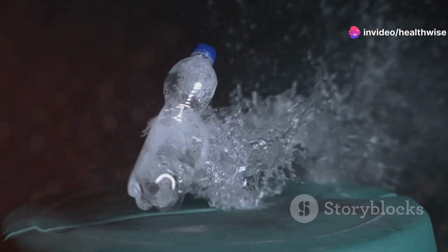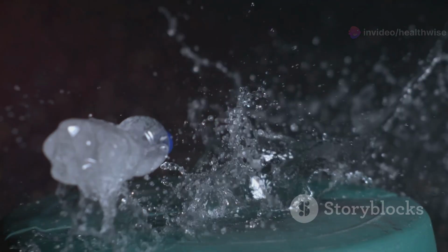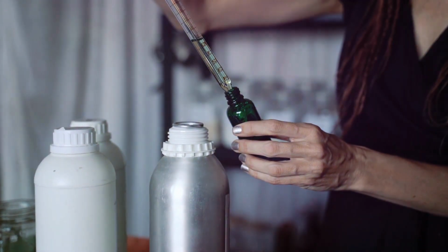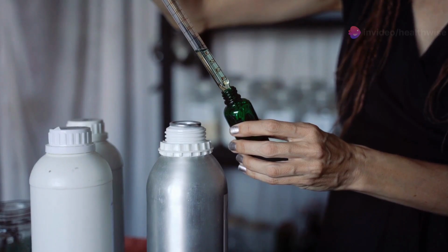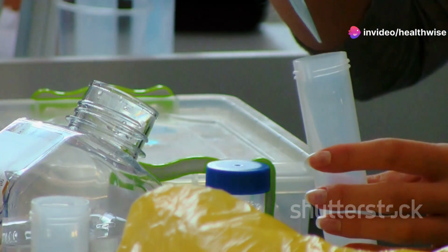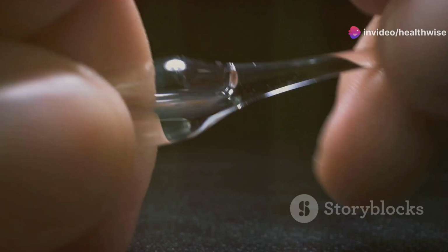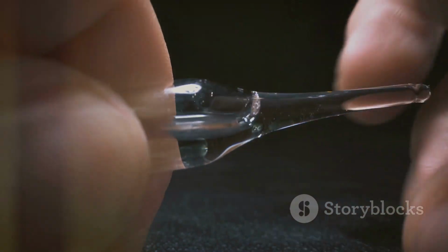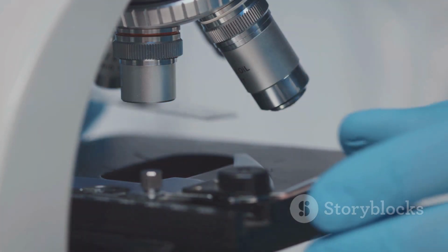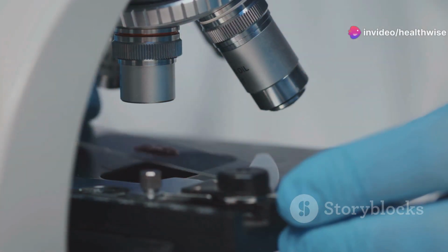2. Quarter fill the bottle with a saturated solution of sodium chloride, SSS. 3. Mix the feces with an applicator and fill the bottle to the top with SSS. 4. Place a cover slip over the mouth of the bottle, ensuring no air bubbles are trapped. 5. Remove the cover slip, ensuring a drop of liquid remains on it. 6. Place the cover slip on a slide and examine it under the microscope.